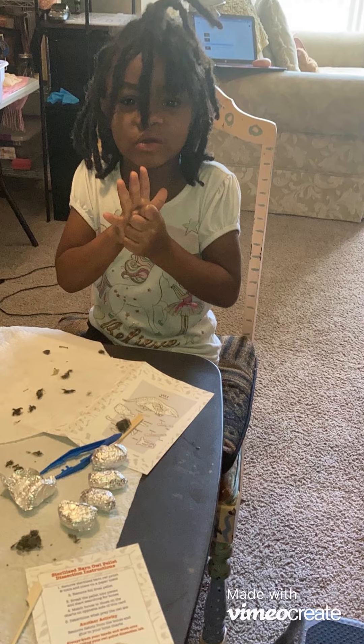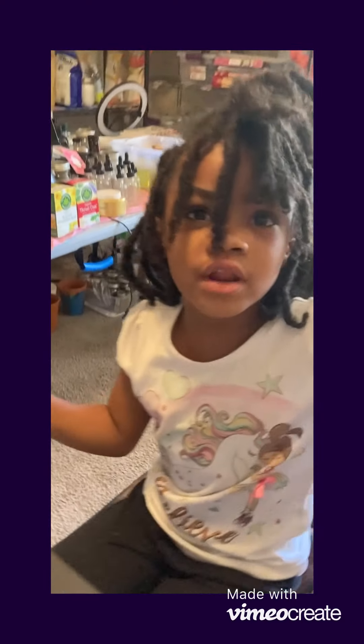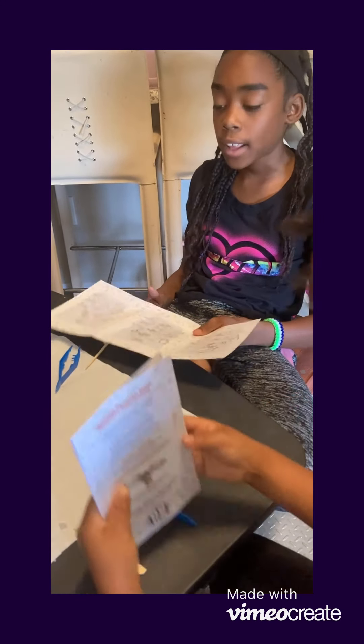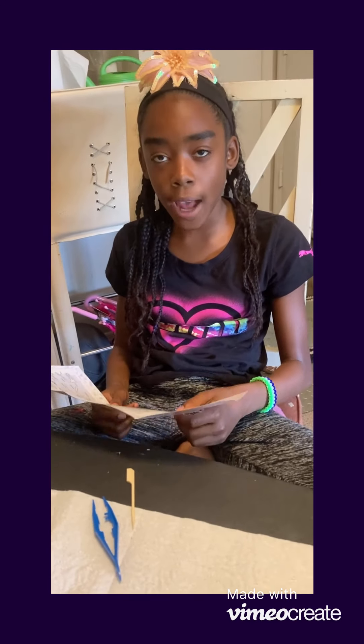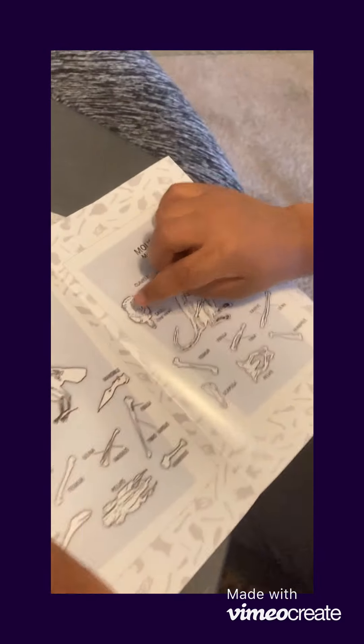So, remove foil from pellet. Break the pellet into pieces and start searching for bones. If you look inside the booklet, it shows you three different types of animals. Our job is to figure out which types of animals are in these pellets — what the owl ate that are in these pellets. We have to look carefully at the bones and dig through them to find the different types of bones.